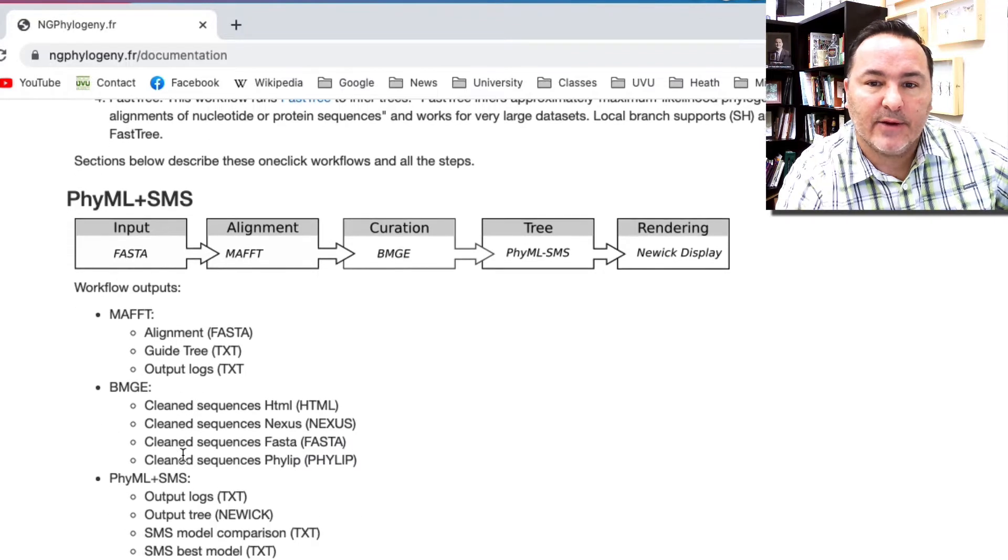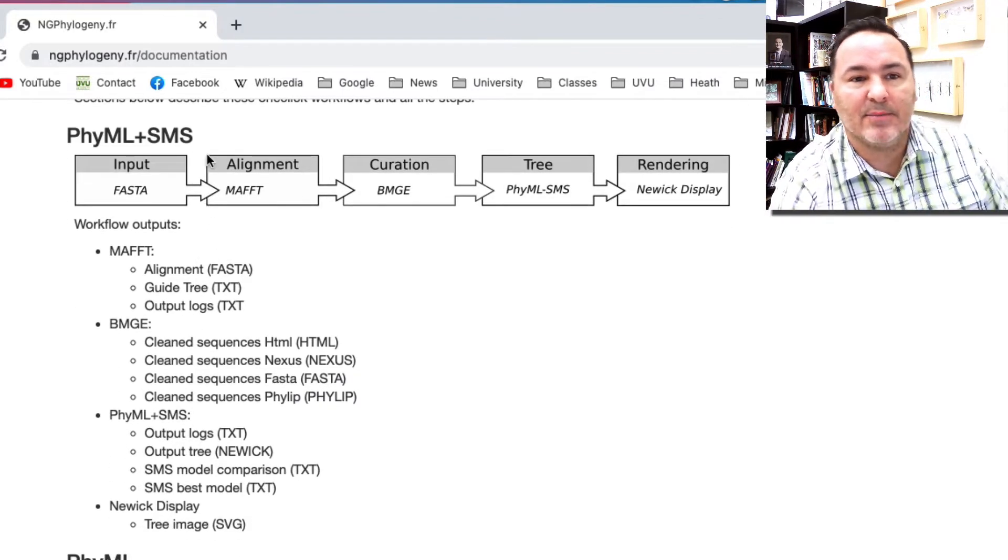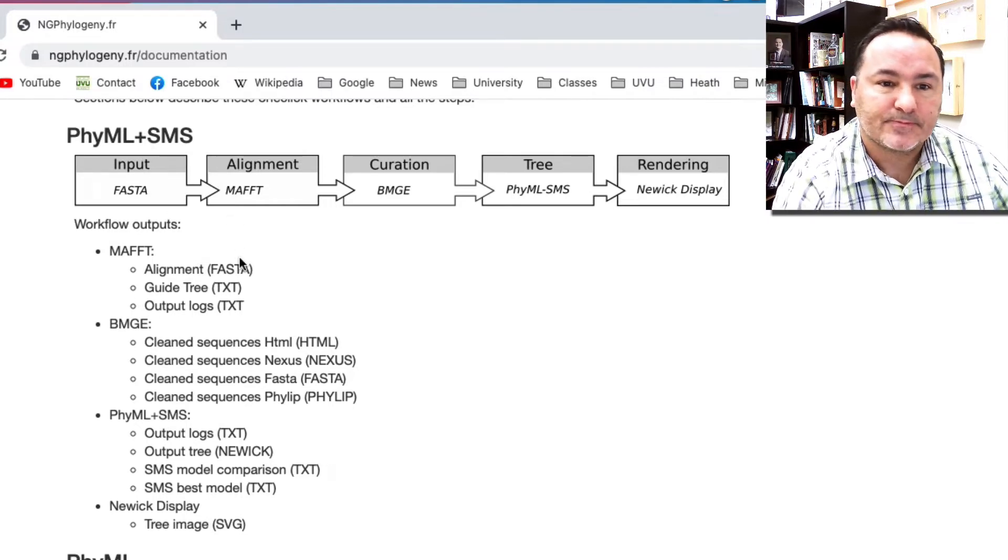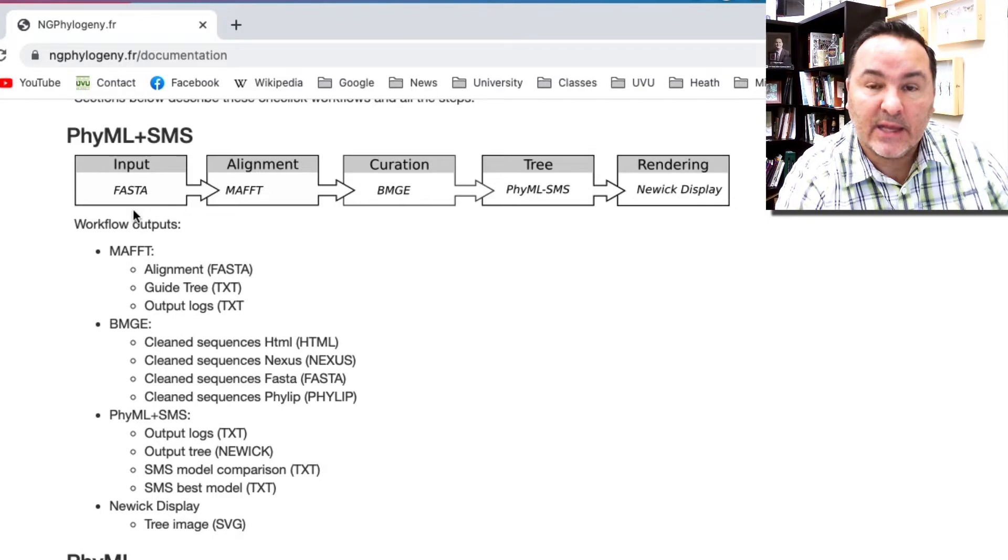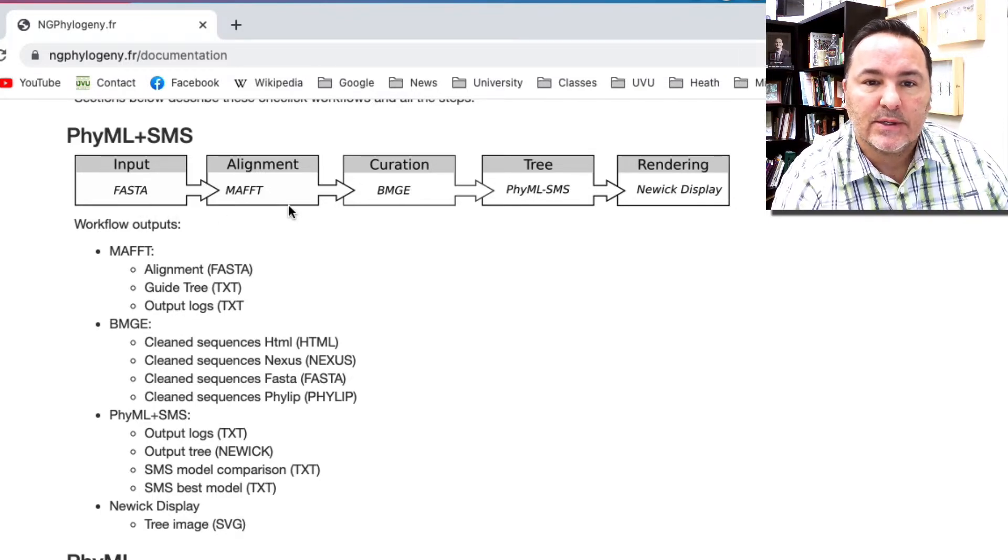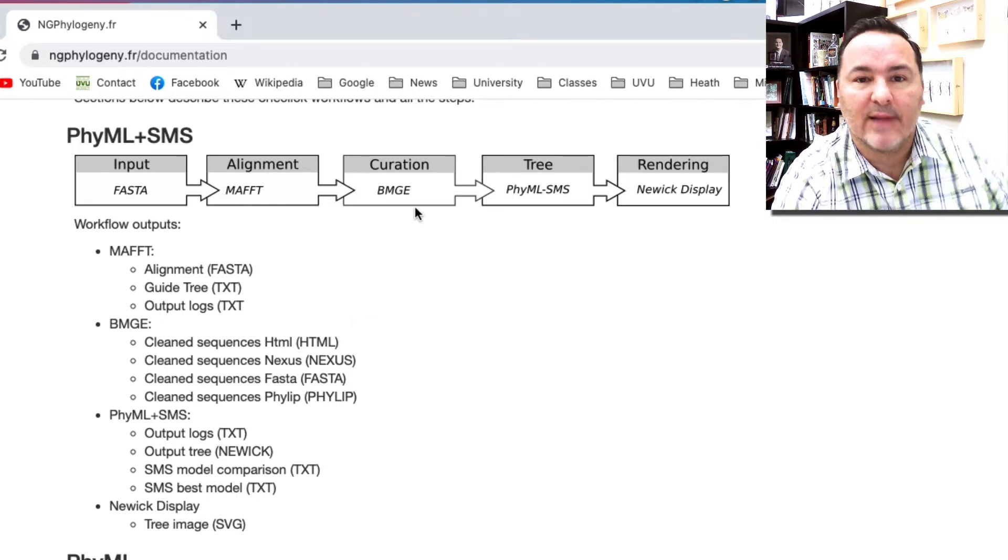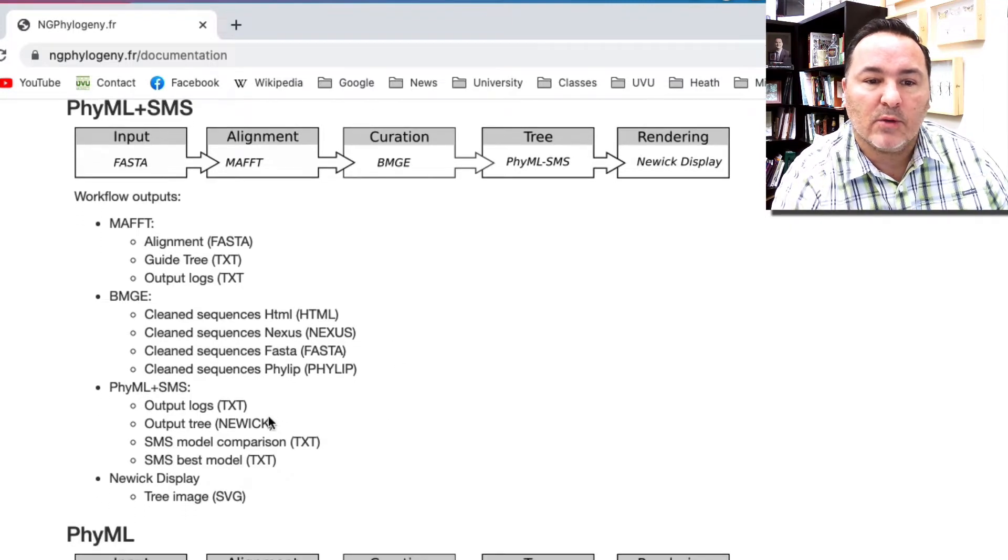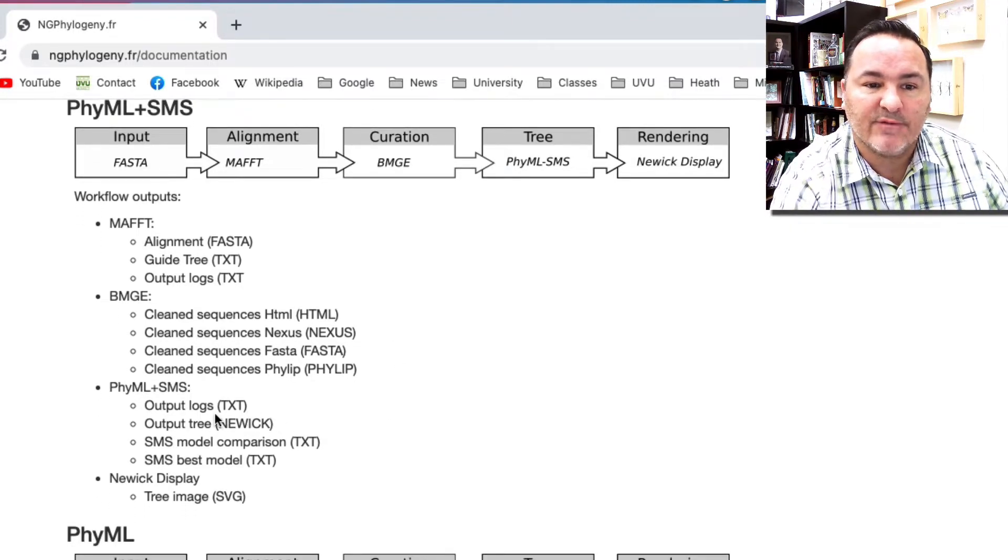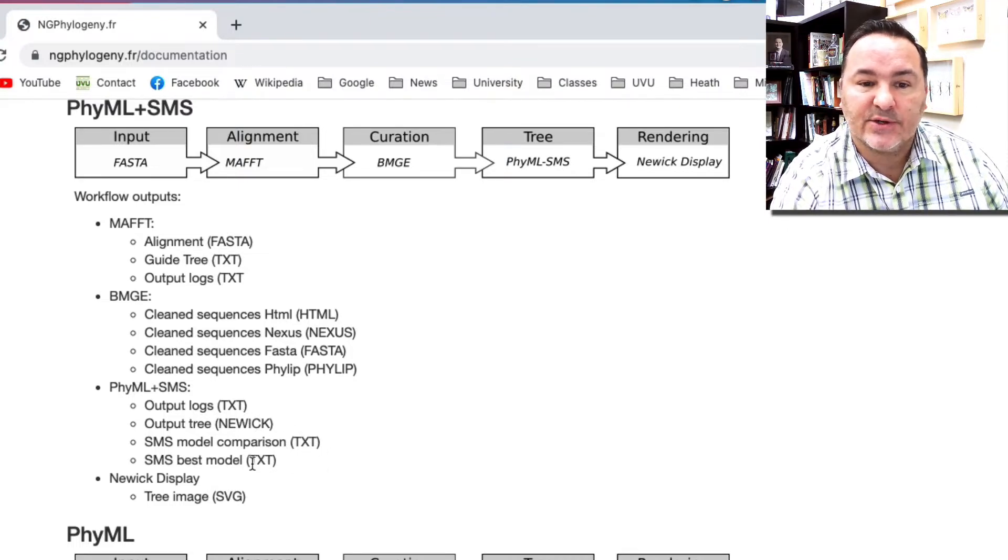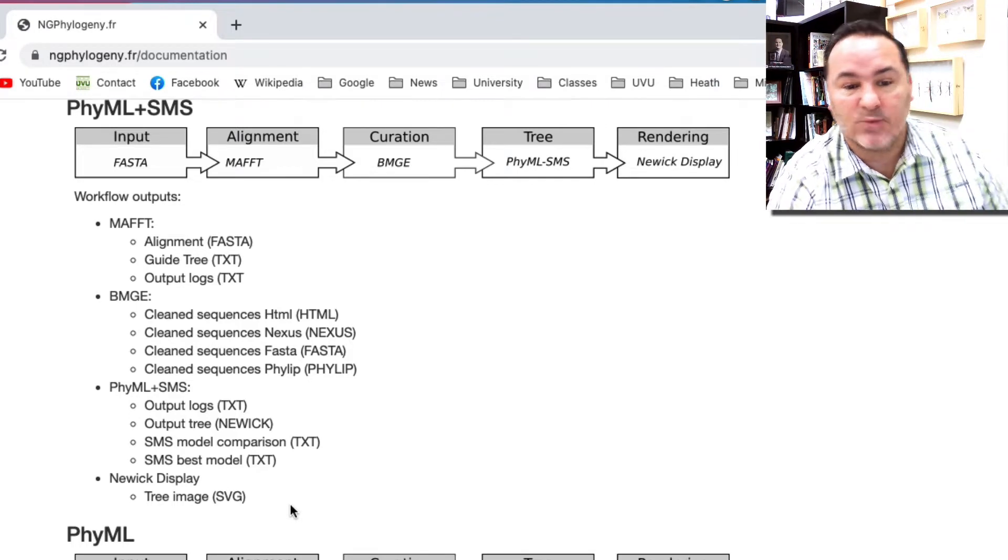These are laid out here in more detail below exactly what's happening. Let's look at PHYML plus SMS. This is going to receive an input data set, then it will do a MAFT alignment. It will also then do a cleanup of that alignment using BMGE, and then it will do tree reconstruction in PHYML, which includes searching for the best model that should be used, and then a tree image.